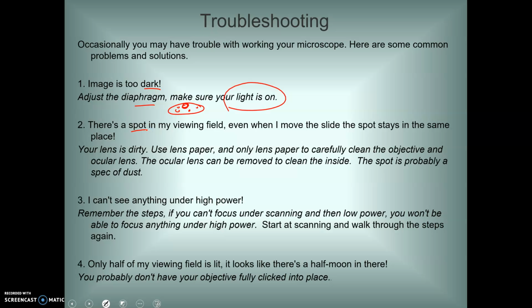Second, you're seeing spots through your viewing field. It's very possible you're looking at dirt. So we want to use lens paper. I actually have also some Q-tips, and we'll carefully clean those lenses and hopefully get off any kind of dirt or dust.